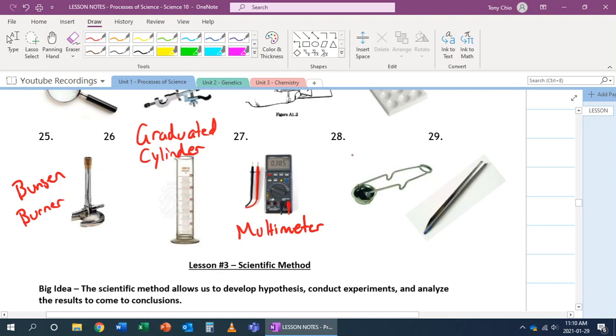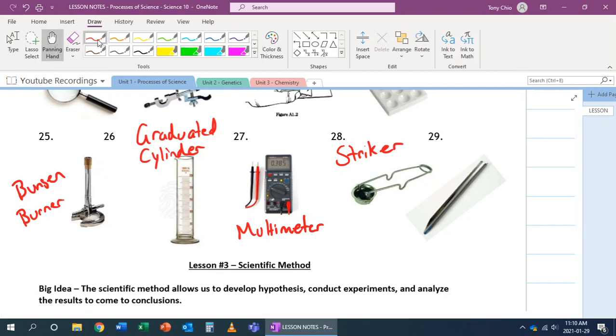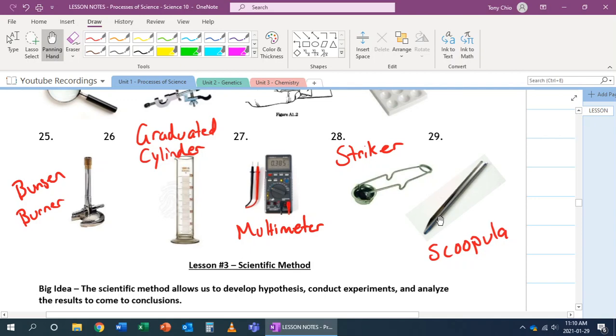28. It's called a striker. It's used to create a spark and, for example, light a Bunsen burner. Last but not least, number 29 is called a scoopula. A scoopula is for you to scoop something, and it's like a spatula in the sense that if you need to scrape something off, you can also use the tips of it as well.